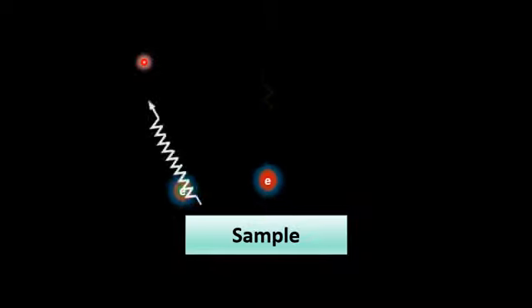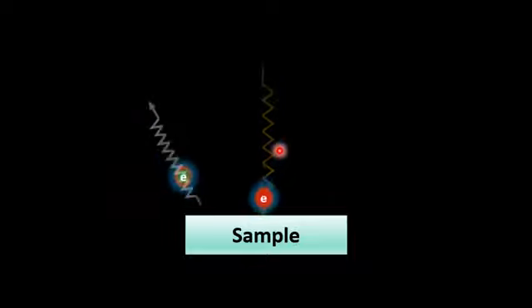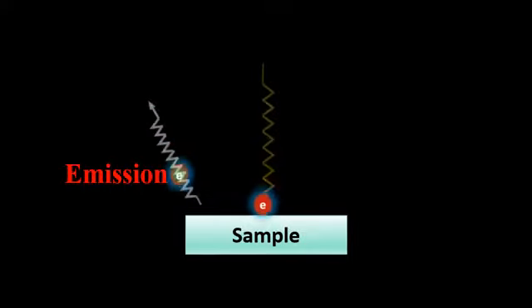Now let us discuss the emission of tertiary or Auger electrons from the sample surface. Student, please note that the removal of the Auger electron from the sample surface is based on emission, which is caused by the incident stream or beam of electrons.